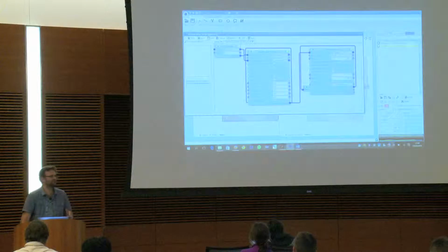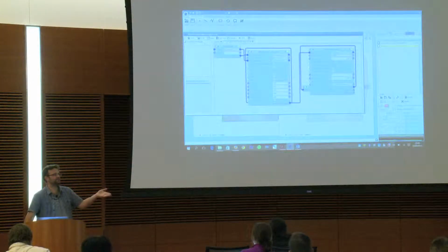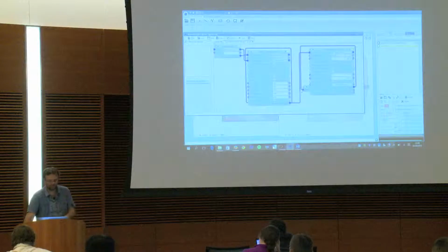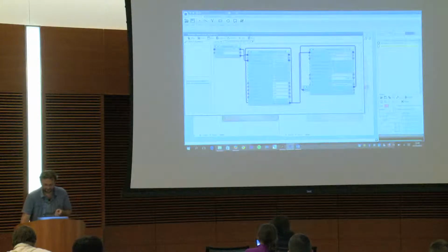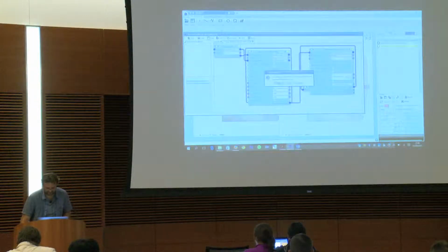But this resource is also on the web, okay? So if you, for instance, create a graphical thing like that, or if you create a script, you just need to create an account on the website, and then you put your things. But you don't really need to be a programmer. If you create a protocol as a biologist, other biologists may use your protocol and then cite you. And there are versions, so you can update them without destroying the one that you created before.